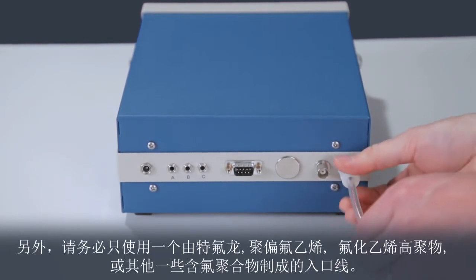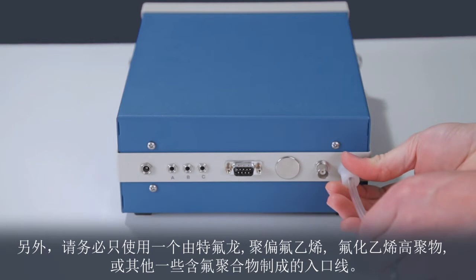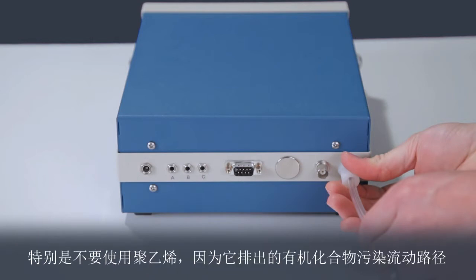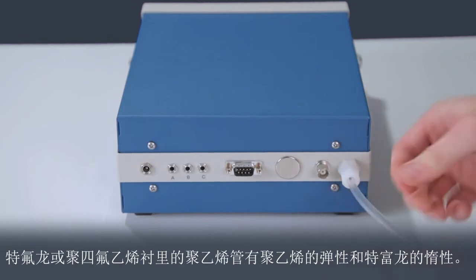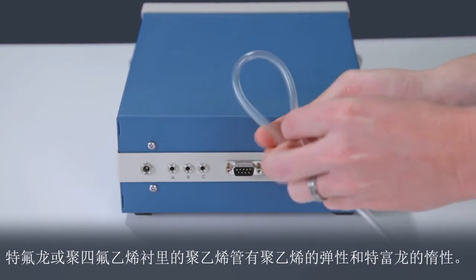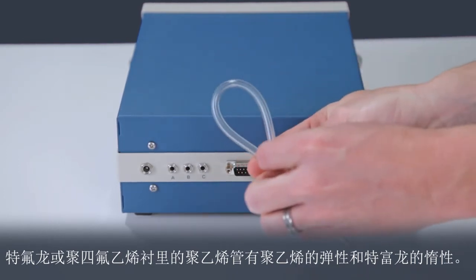Be sure to only use an inlet line made of Teflon, Kynar, FEP, or some other fluoropolymer. Especially don't use Tygon because it outgases organic compounds that contaminate the flow path. The tubing we prefer is Teflon-lined Tygon such as we are using here. Teflon-lined Tygon has the flexibility of Tygon and the inertness of Teflon.